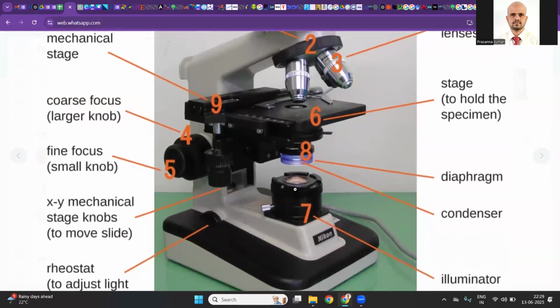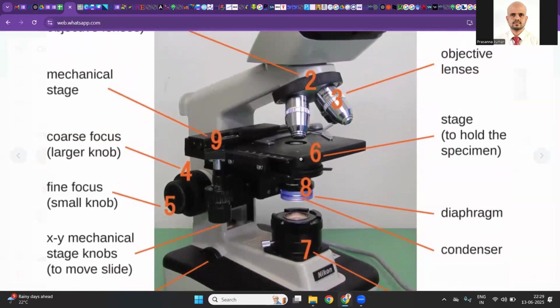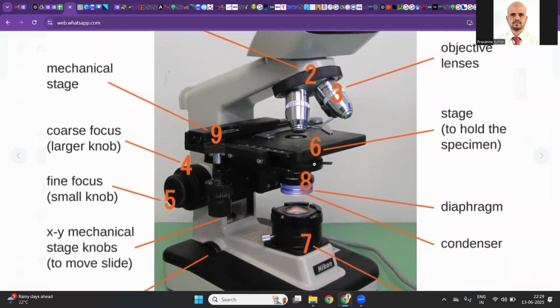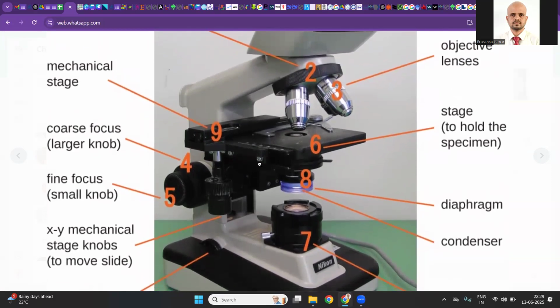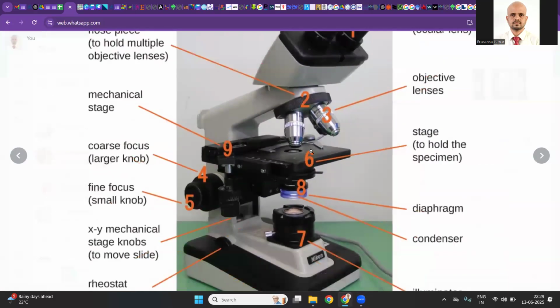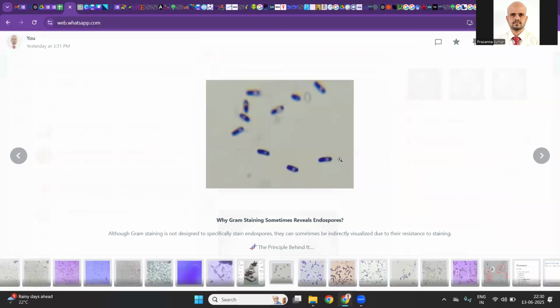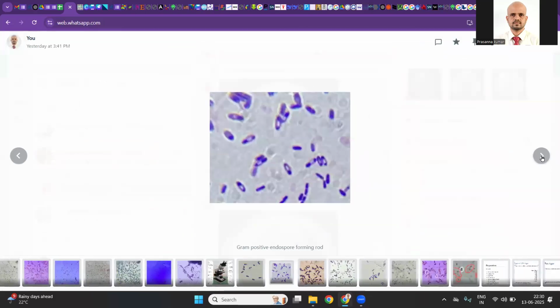So in my experience, when I keep this condenser stage very close to the stage, there could be more intensity of light coming in, but the contrast is much better. Now I can control the intensity of the light with the diaphragm adjustment. Then I will work on the voltage, and voila, you will have very precise cells to be documented like this. Okay, so contrast can be increased.